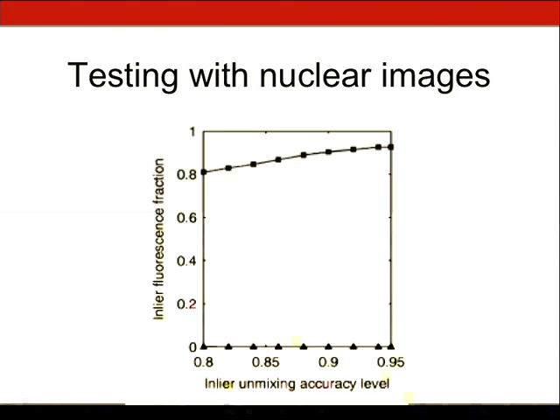When we use a threshold on this distance from the object type, or the probability that this object is from that particular type, as we raise the threshold, what we will end up doing is eliminating real objects that are actually of that type to an increasing degree, and we will therefore, for the real data, for the true lysosomal data, the accuracy of unmixing, the recovery will decline slightly.